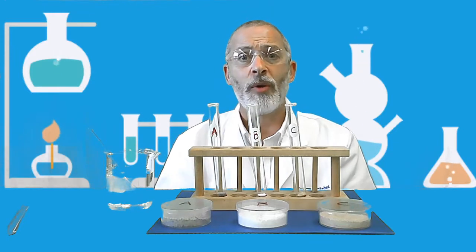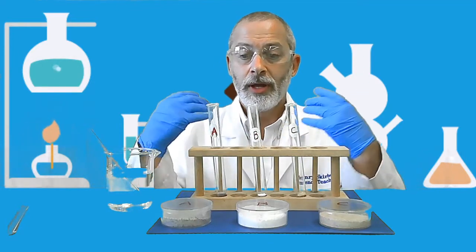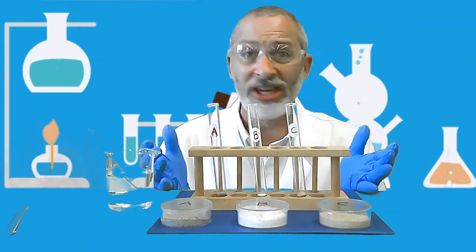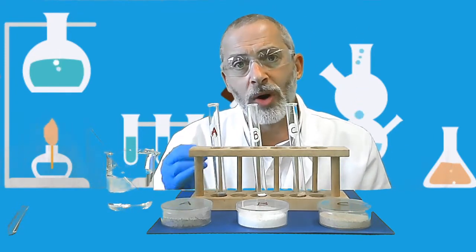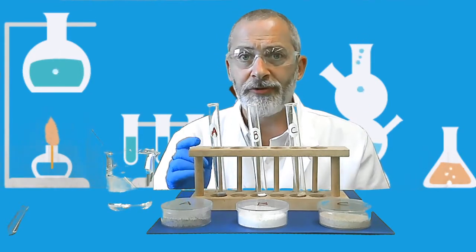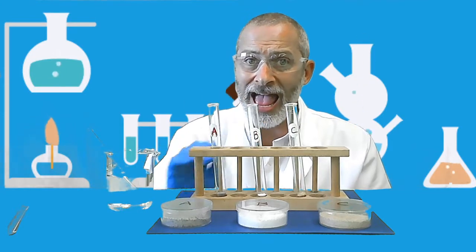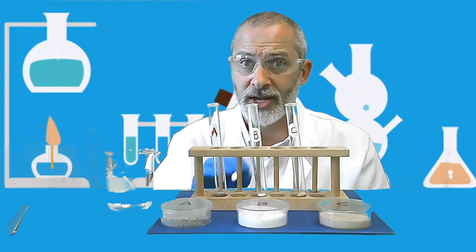Before I do that, however, I want you to think for a moment. If there are chemicals in here, if there are living things in here, if there's nothing in here other than mineral soil, I want you to consider what observations we should be looking for. You can pause me for a moment and look at your lab procedures. There is a note in there for you to read before I add these basic needs to our test tubes. So pause me now and discuss.